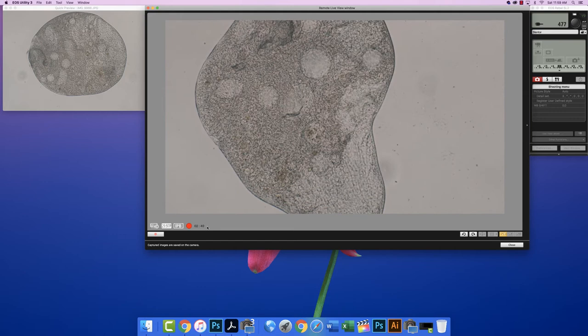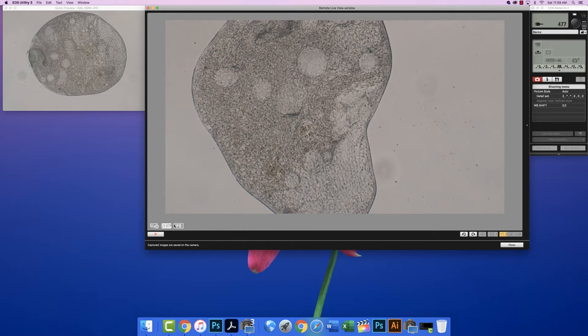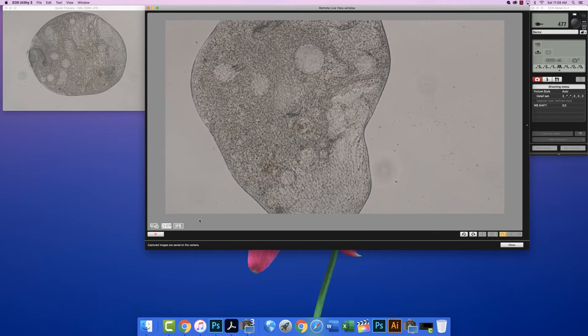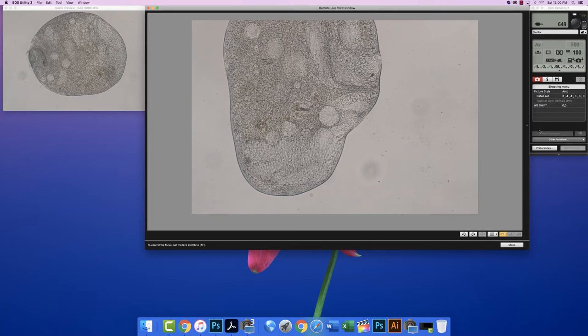Okay, so now I'm going to stop the video by pressing this button, and my counter disappears, and the movie recording is stopped. And now let's go up to 40x. I'm going to switch this back over to still images. We get this data box that says warning, download recorded movie files. So I'm not going to download it yet. I'll download it from the card later. I have to reopen the live view window here. And let's refocus at 20x.